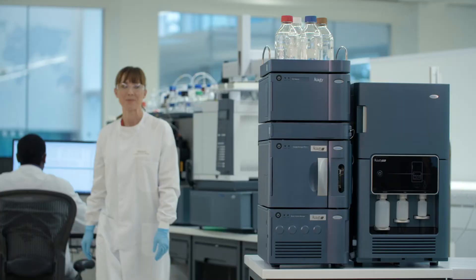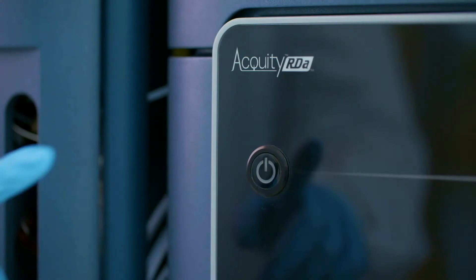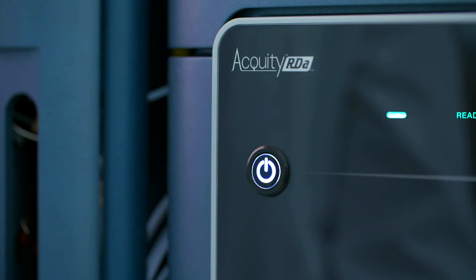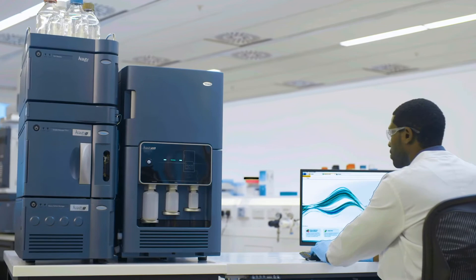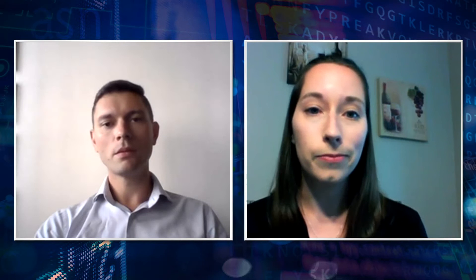And so what does the BioAccord bring to the table for this kind of work? Well, BioAccord is a relatively new instrument, released January of last year. It's very easy to use, it's compact, and there aren't many parameters to deal with on the mass spec side. So method transfer and method development are pretty easy. And best of all, it's all under Unify software, so it's compliance ready — it would fit in manufacturing and QC environments.